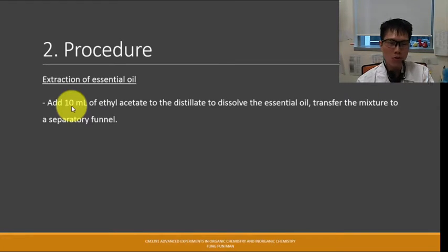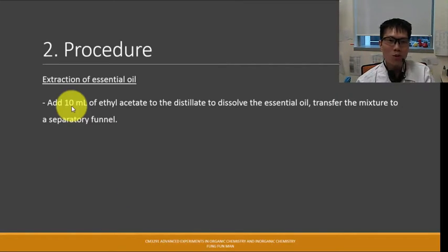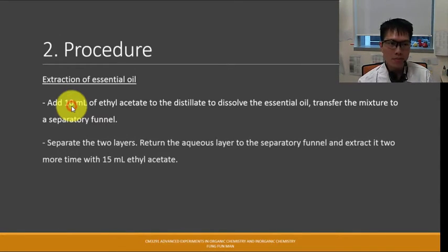Just think about it. What is it used for? It is for the collection to draw the oil from the suspension of clove oil and water to the organic phase. So the more you have, it can be a disadvantage or could be some merit. It depends. Later on, you may need to do 2 or 3 times rotavap to evaporate all the organic solvent, but it doesn't really significantly change your compound integrity and whatsoever. So please fret not.